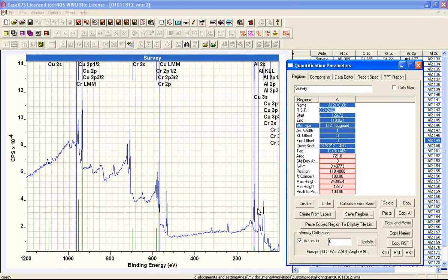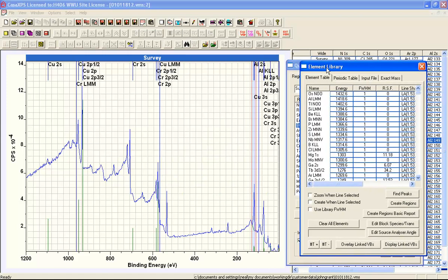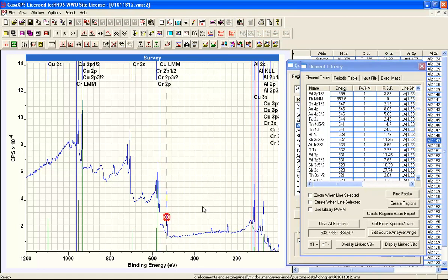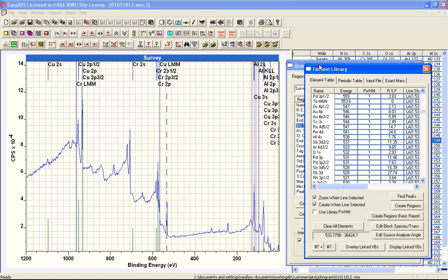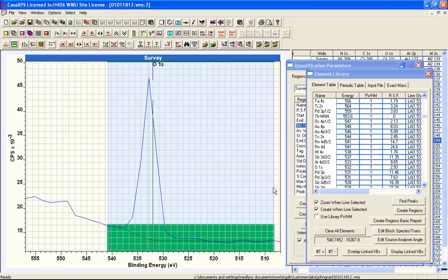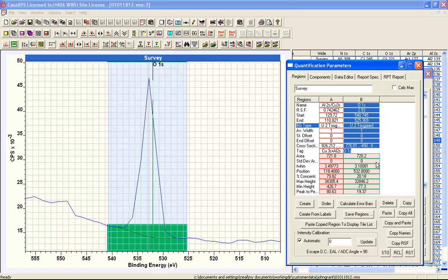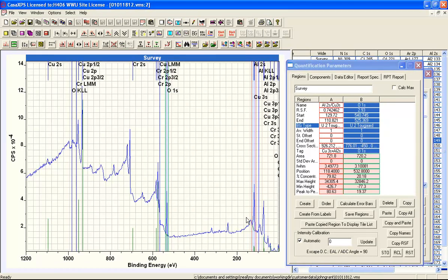We can now start adding regions with elemental RSFs that will contribute to the overall atomic concentration calculation. For example, adding a region for oxygen as part of the quantification gives us an elemental RSF. A tag field is required when using quantification by tags, because only regions and components with a tag field value other than 'no tag' will be included in the quantification. This means going through and creating regions for each element of interest.